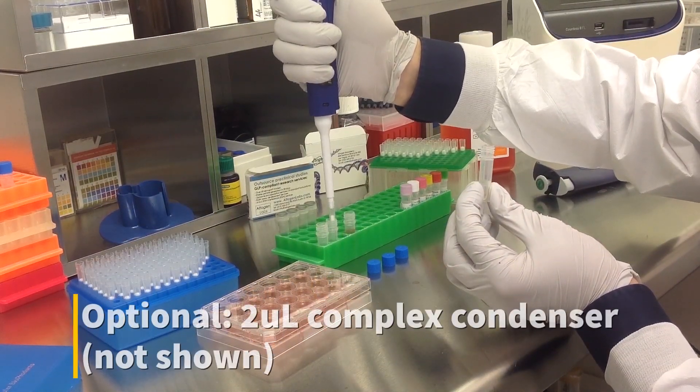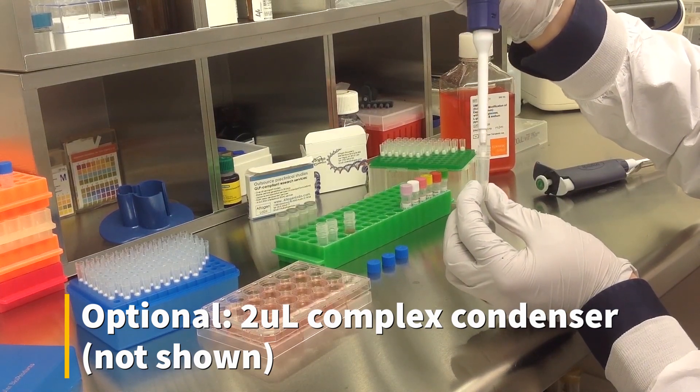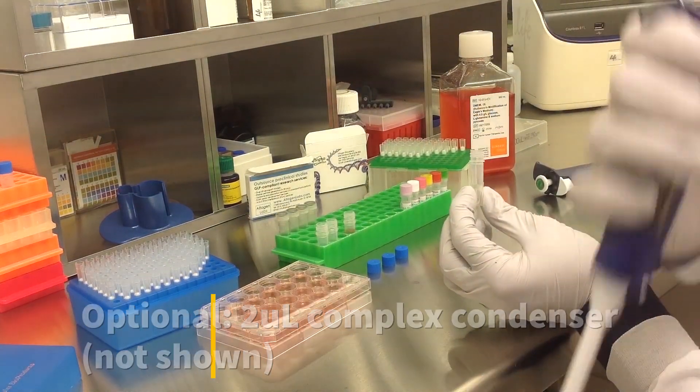An optional step is to add 2 microliters of complex condenser, which increases transfection efficiency but may also increase cytotoxicity.